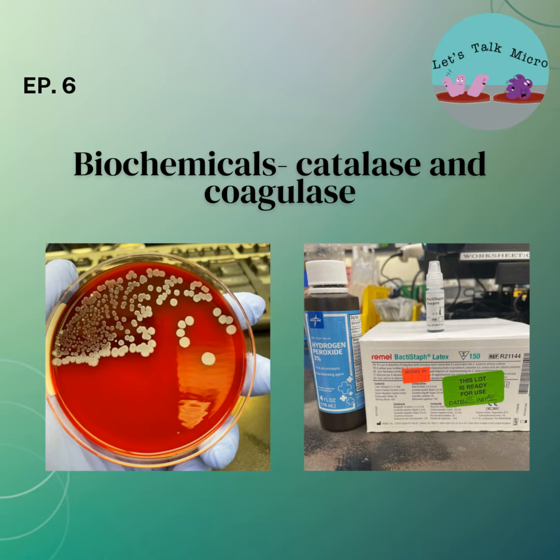Well, the reason is that Enterococcus, which is not a part of the staph, can have what is called a weak positive reaction. After the colony comes in contact with the catalase, after maybe 2 seconds or so, you can see some bubbles. And this is not considered a positive reaction. So you should see it very strong. When you have a staph, you add that colony and right away you see those strong bubbles.